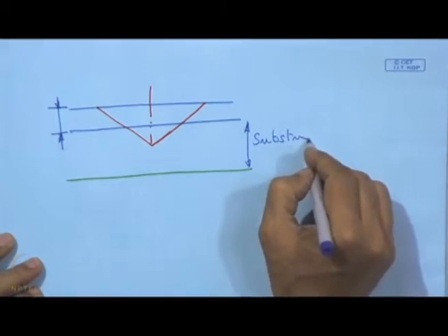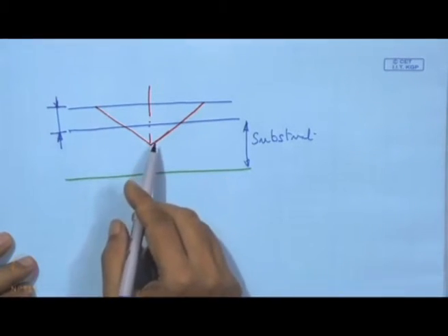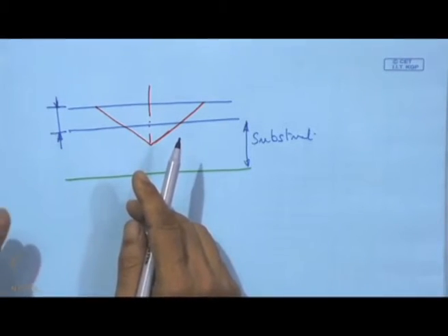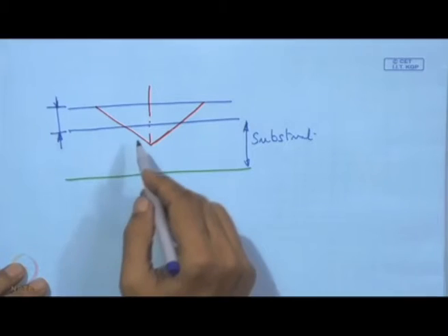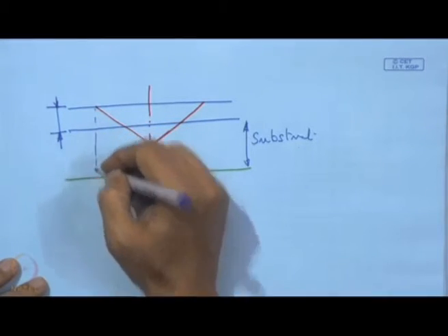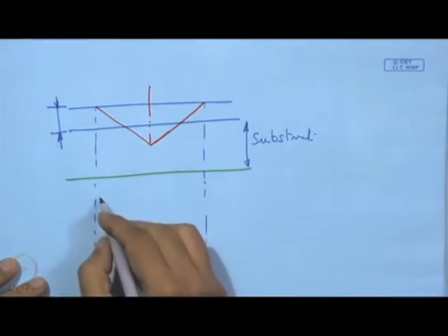So, what we can see here is that this indent area under indentation has two portions, one portion that is well within the coating and another portion that has gone deep into the substrate. Now, this can be further illustrated by another simple diagram. Say we can have a quick look here.